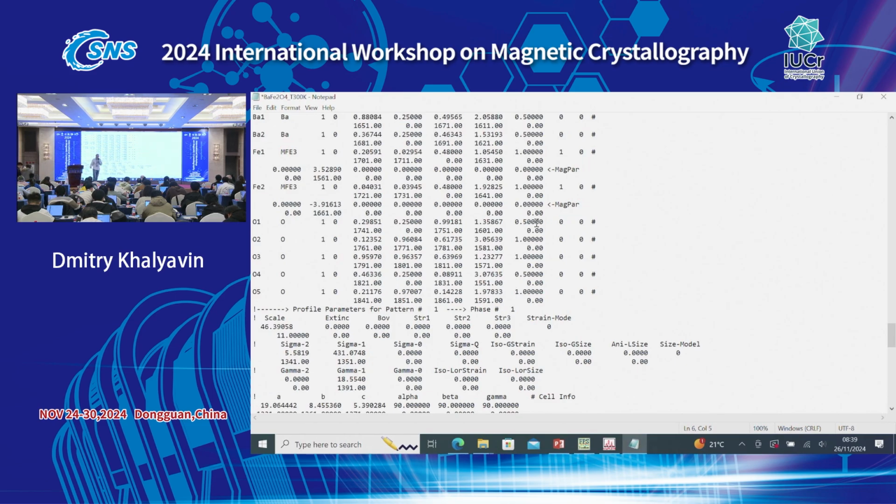Yeah, or maybe it's a problem with oxygen stoichiometry, so simply the occupancies are not right. So we have just less oxygen at this position, and it's trying to compensate for that with the thermal parameter. But that depends, and again, you need to know your sample well, how susceptible it is to oxygen non-stoichiometry and so on.